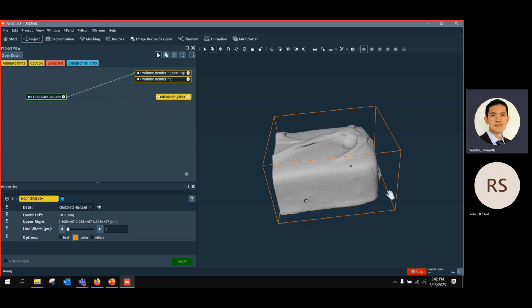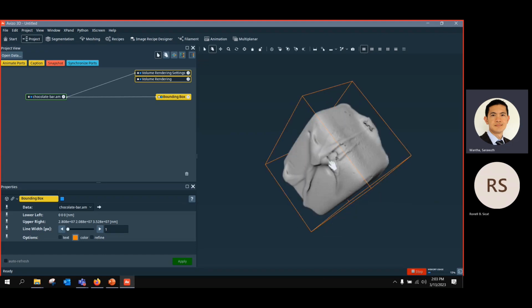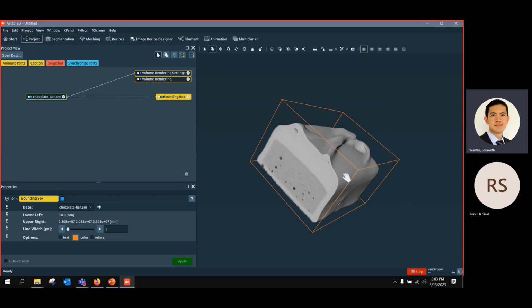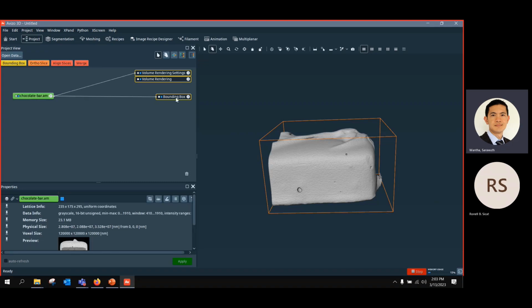For example, in CT scan, sometimes you want to have objects that are aligned, but it's not possible because it's tilted due to the nature of the structure like this, and you want to tilt it back to align with the principal axis or some axis. So you can do that by using slice and then register and resample transform image to align the new axis to the reference axis. So let's start doing this.